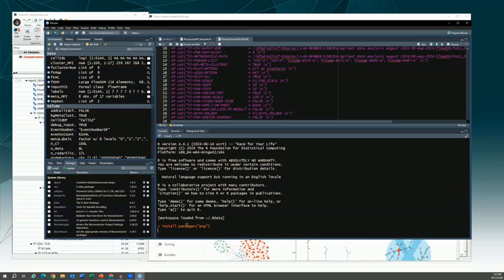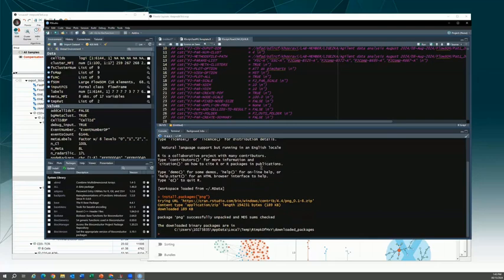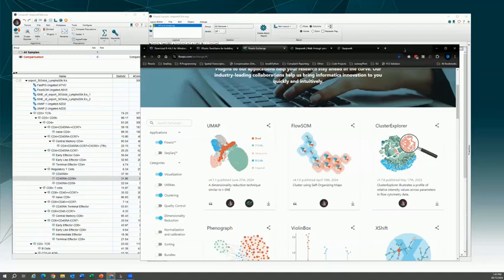But if you were to get a message pop up saying, I'm going to create a folder for you, do you want me to do that? Just click yes. That will make sure that going forward, when you run a plugin and it's trying to auto-install, you shouldn't have any problems, and it's going to be able to install and put things wherever it needs to. So I would say install R, try to install a package, and let it create a folder wherever it needs to. Once that first one's good, you can close R and then try to run a plugin.